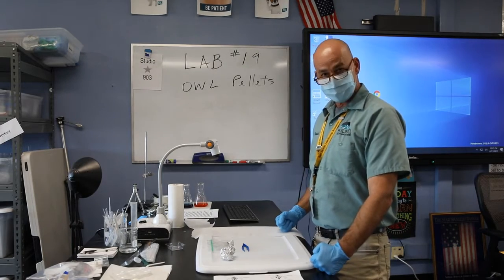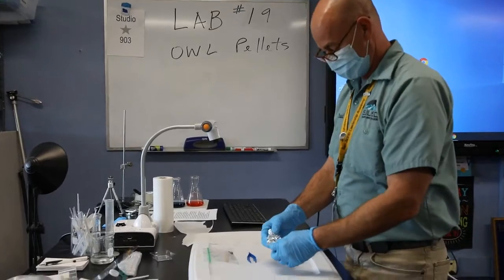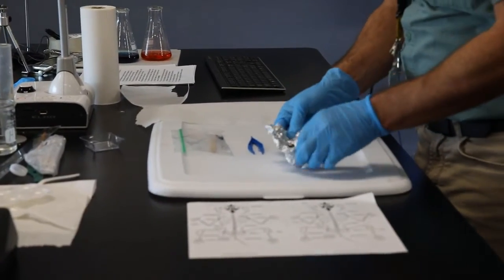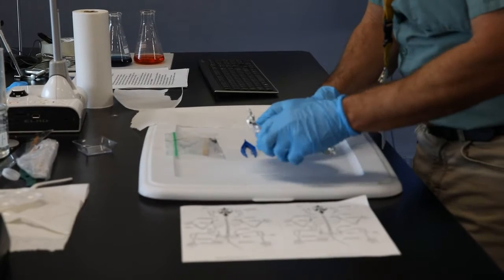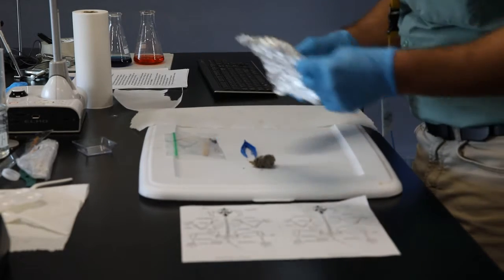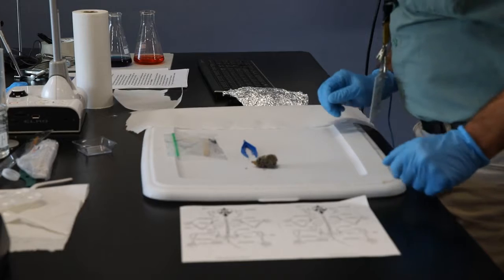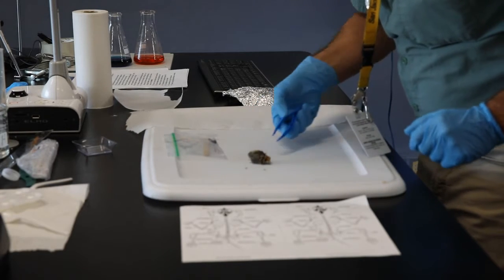All right? So, Dave, you have an owl pellet in front of you. Dave's going to enjoy tearing this thing apart. I was excited about this one. I love owls, and this is really fascinating to me. So we'll play in the background the owl pellet song. Dave is pulling the foil away. He's wearing gloves. The pellet that Dave is using is not sterilized. The pellet you have has been sterilized.